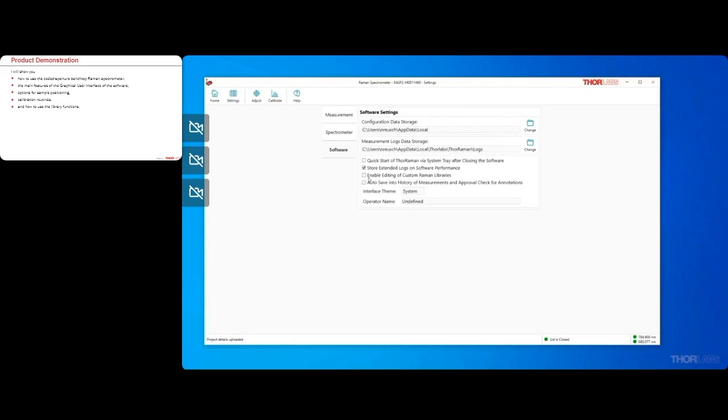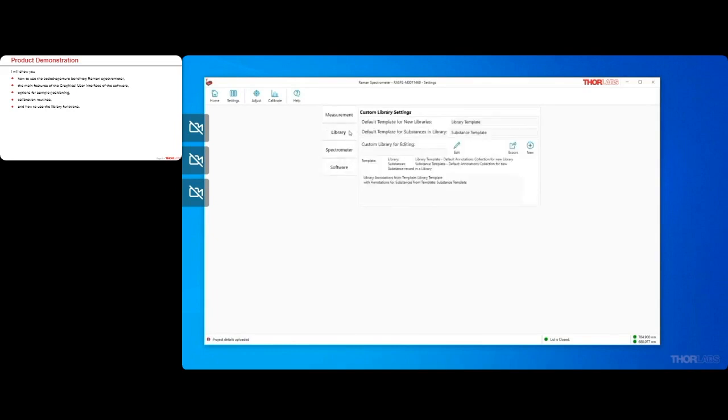After enabling editing, a new submenu is now available and we can choose between different templates. These define which additional information fields, we call them annotations, go with each database element. Some of these fields are defined mandatory and others are optional. The templates are predefined, but if you have different requirements, please reach out to me or our tech support team to discuss customized versions of the templates.